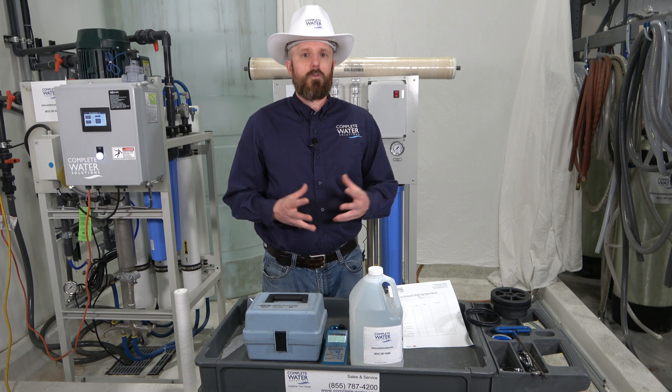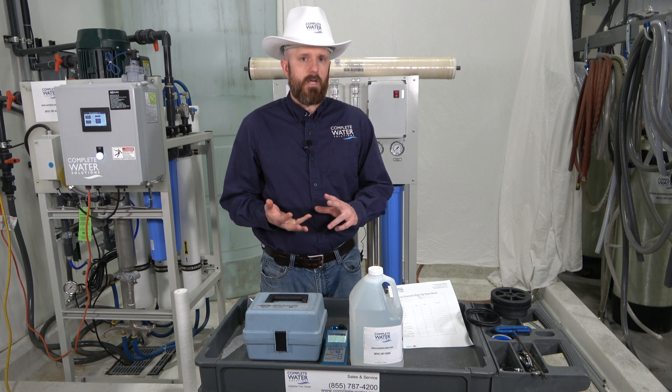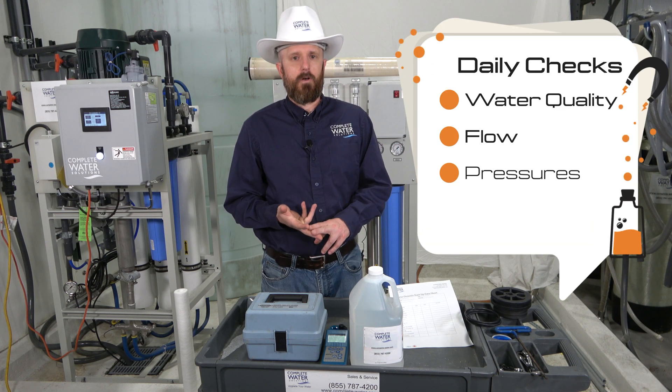The first thing we want to discuss is what should you be doing daily? Those things include water quality checks, flow checks, and pressures.